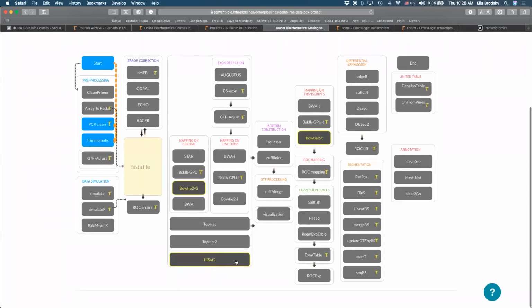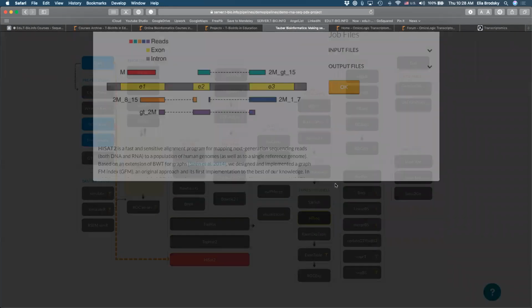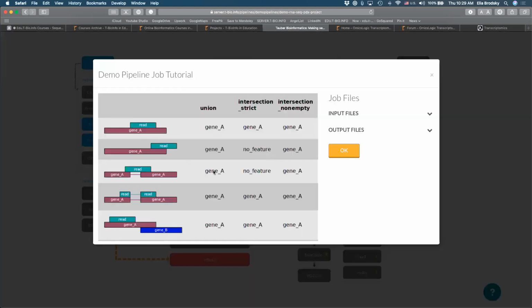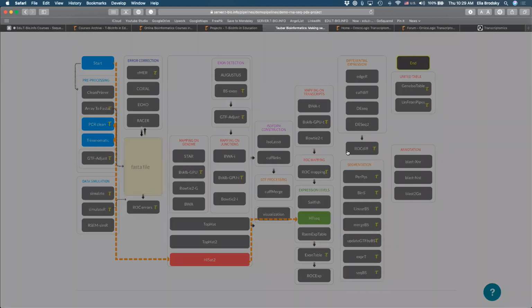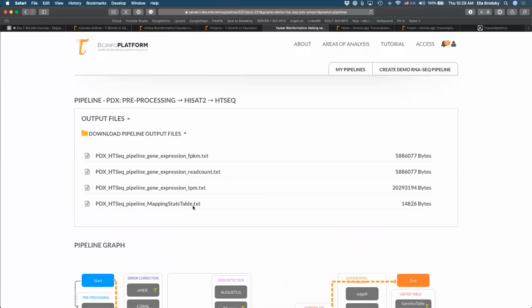Then we can look at mapping techniques to the reference genome or transcriptome and develop a sense of how high is the expression for a particular gene or isoform, ultimately looking at the gene expression table. So once this pipeline is complete, you'll be able to see some of the output files, and we'll discuss downstream analysis. I'm going to pause here.